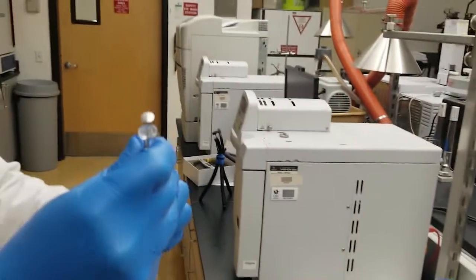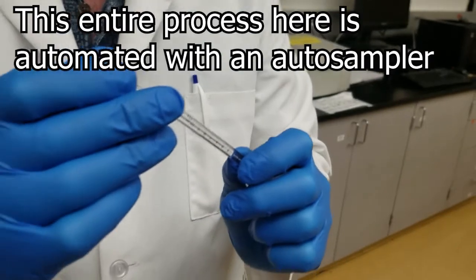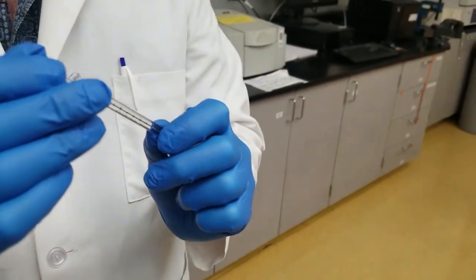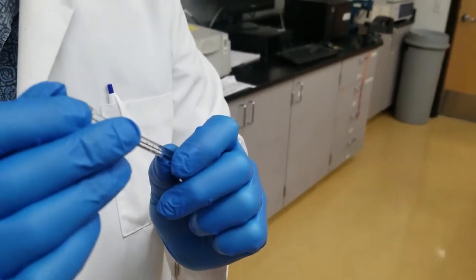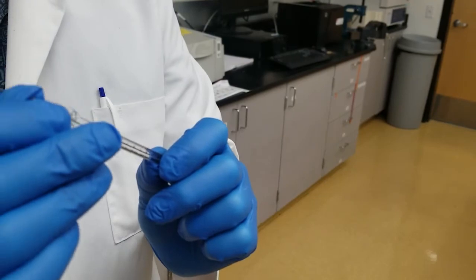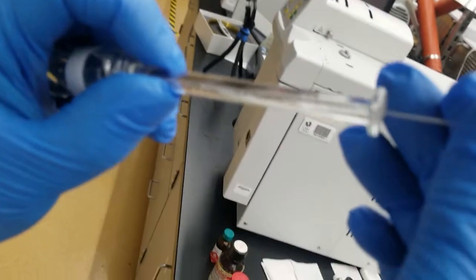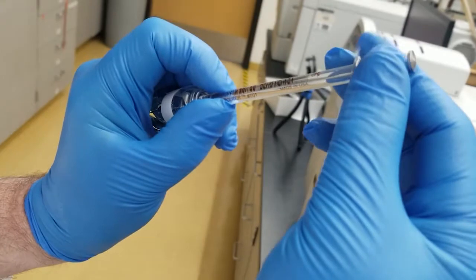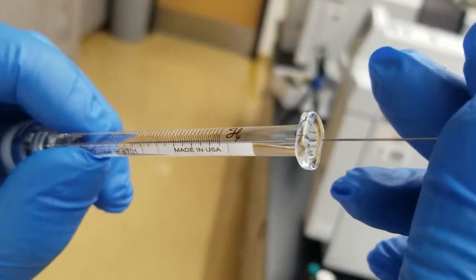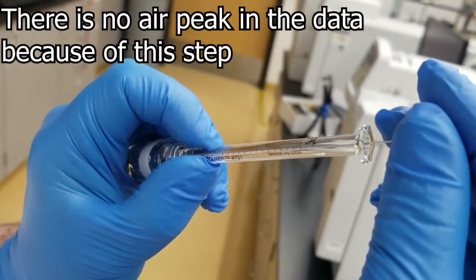When you load your sample, you actually have to run the plunger up and down several times to get the air out of the syringe. It may take a longer time for some, depending upon the viscosity of the sample. So I'm running this up and down, and I'm looking along the side to see if there's any air coming in. You can actually see when I pull back the syringe, if I pull it back too fast, that there's air right below the plunger tip. And so now if I keep doing that long enough, then I don't get any air in the syringe.